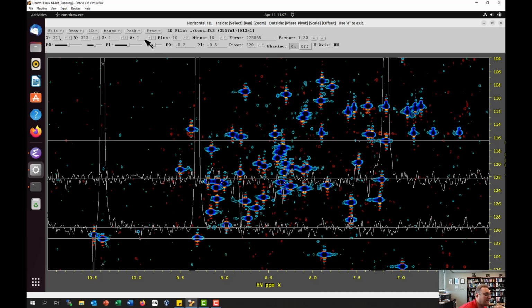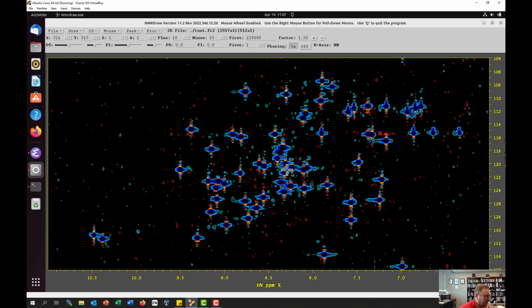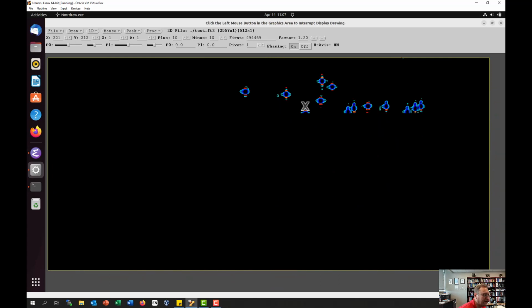However, if you have a very broad range of chemical shifts, you might need to use a little first order phase correction. So I can type lowercase e to get all this out and exit out of this. I can type Shift T and now bring my noise up.